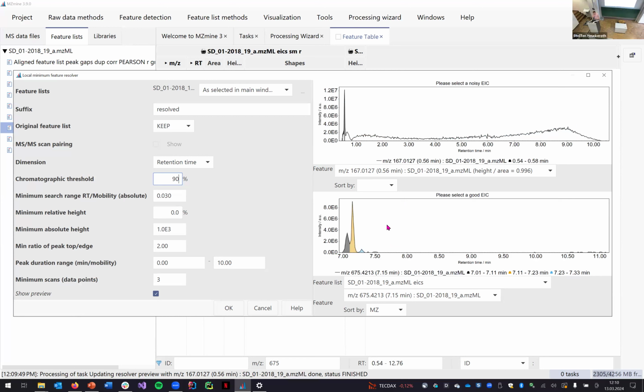What it does is look at all the intensities in the full chromatogram, from start to finish of your measurement, and it only keeps the 10% of the highest intensity, and throws out 90% of the data points with lower intensity. This removes most of the signals. Usually in your extracted ion chromatogram, you don't have signal after signal after signal, but for example in the bottom you have 3, 4, 5 signals on the same mass to charge ratio, and the rest is just zeros. So it will remove the zeros, but keep everything that has a meaningful value.